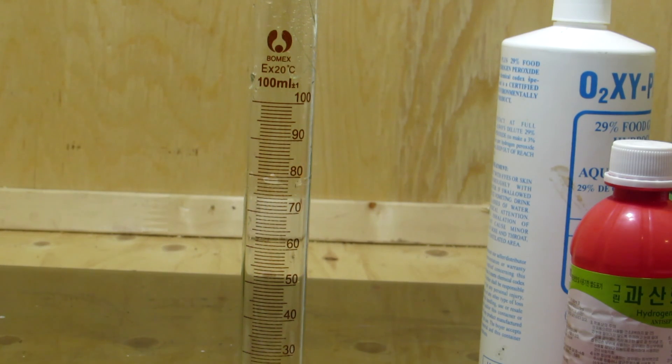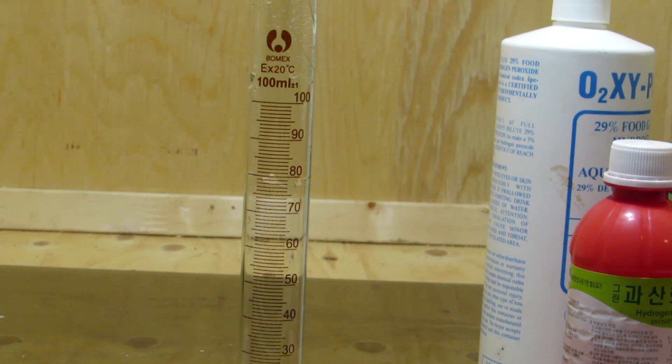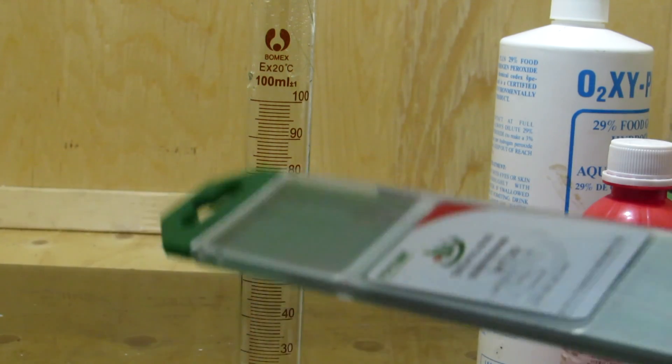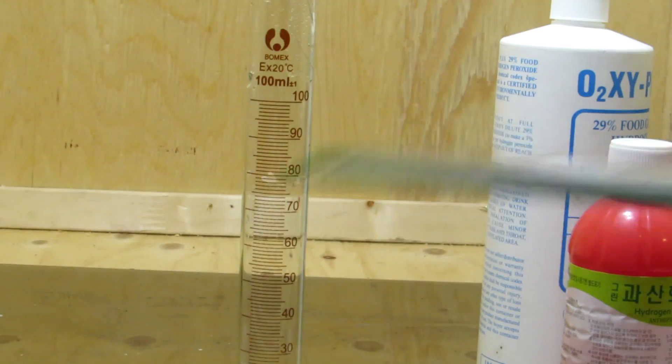Thorium dioxide used to be used in gas mantles, however due to its radioactivity, nowadays cerium and lanthanum oxides are used instead. Thorium dioxide is still used in thorated tungsten welding electrodes however, so I headed onto eBay and bought 10 rods for $8.